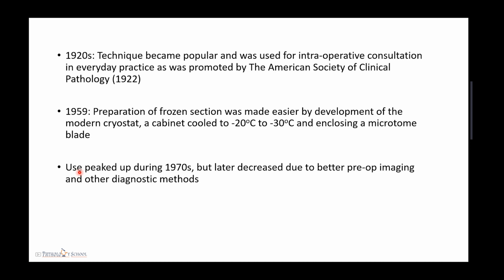Then in 1959, preparation of frozen section was made even easier by the development of the modern cryostat, which is a cabinet cooled to around minus 20 to minus 30 degrees Celsius, and it also encloses a microtome blade. The use of the frozen technique peaked during the 1970s, but later decreased due to better pre-op imaging and other diagnostic methods.